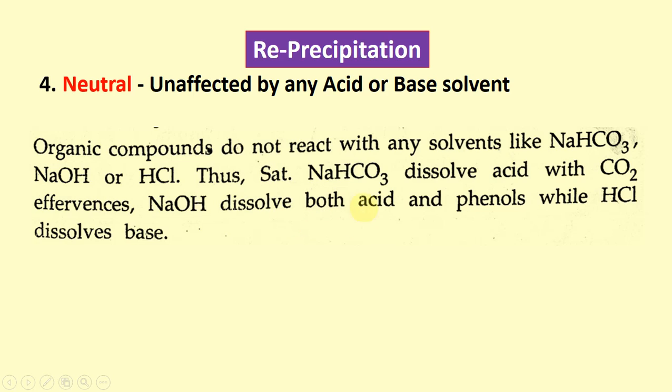NaOH dissolves both acids and phenols, while HCl dissolves bases. Phenol needs a strong base, acid needs a weak or strong base, and base needs only a strong acid.